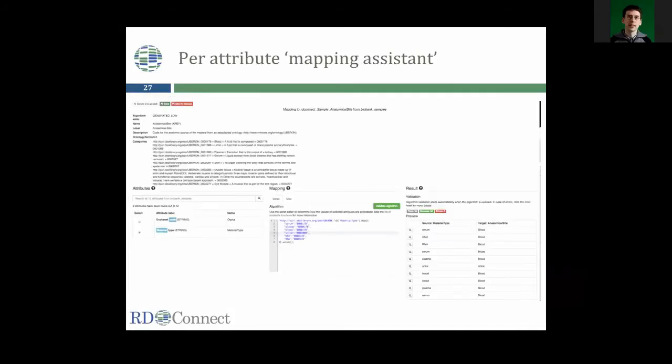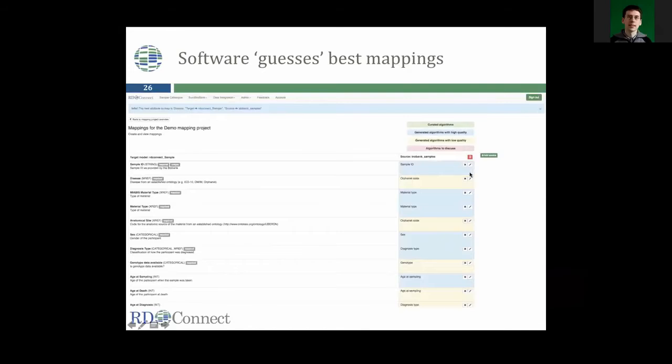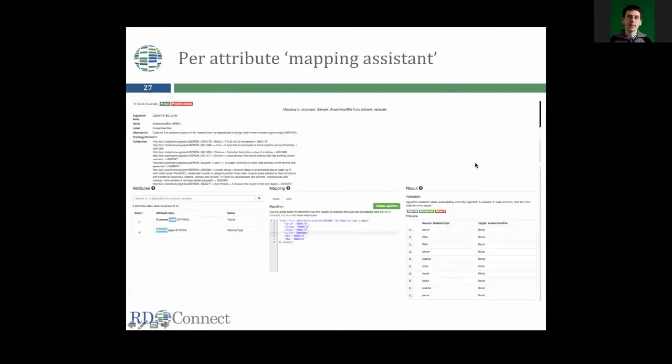So for each of these mappings, we can click on the pencil icon to edit them, and then get into this screen. This might be a bit intimidating, but I'll explain it in more detail. At the top, there is some information about the field that this mapping is dealing with. If it is a list of acceptable values, then that list will be there. The name of the field is there.